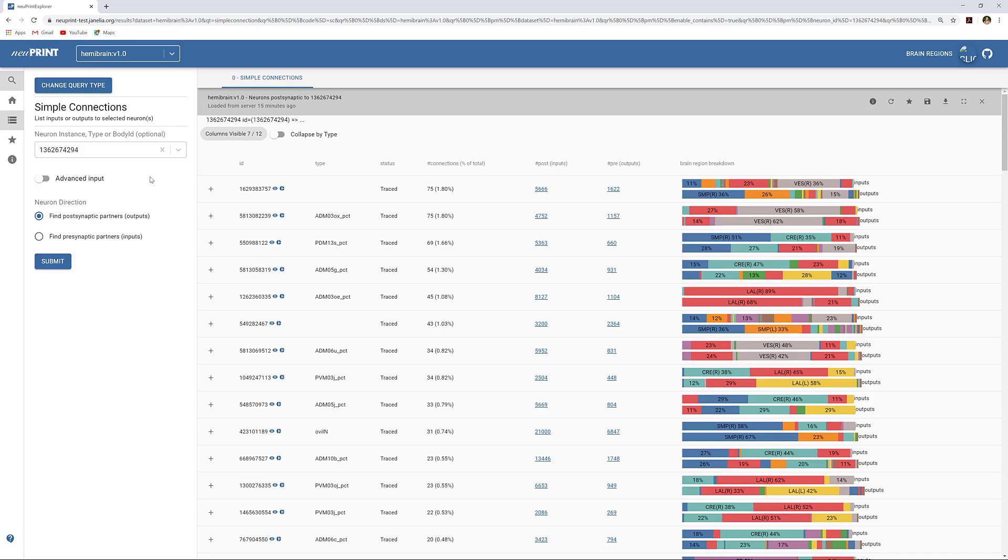This video will go through how to suggest edits to bodies in NeuPrint. To begin, make sure you are working in the most recent dataset.